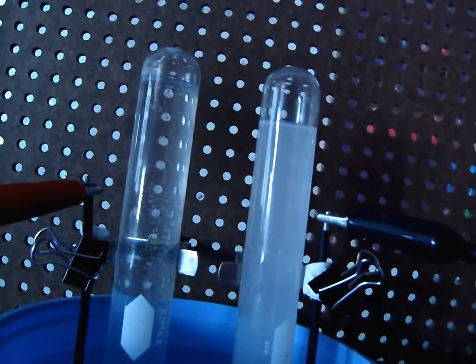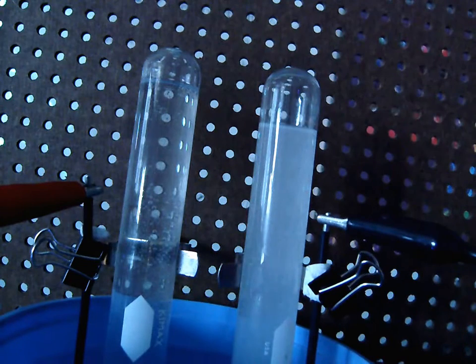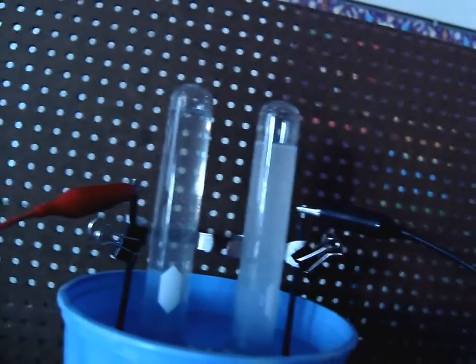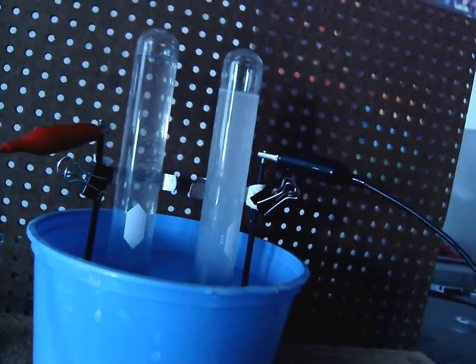Okay, so one more thing that I wanted to talk to you guys about in terms of how this is set up and what's going on is, in this particular lab, we use something called a catalyst. And this is definitely something that will come up when you guys get to your semester exam. So it's important to talk about it. This reaction all by itself would work just fine.